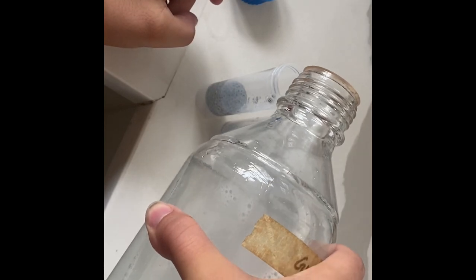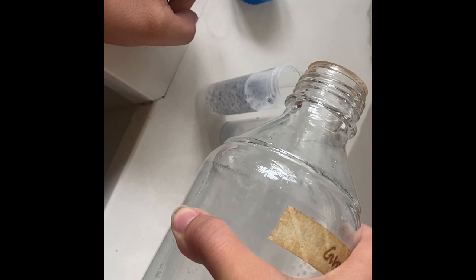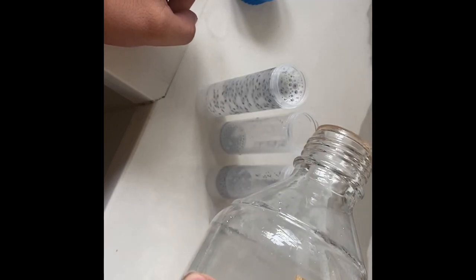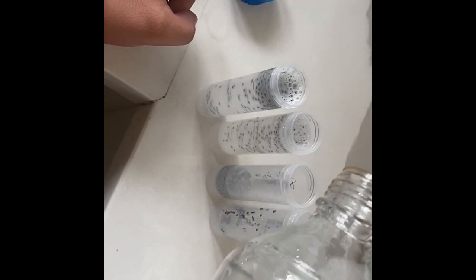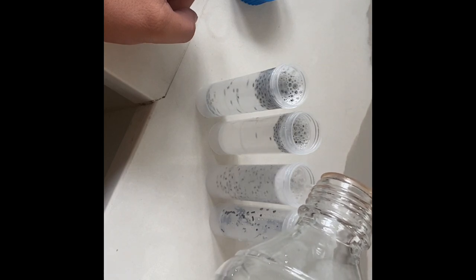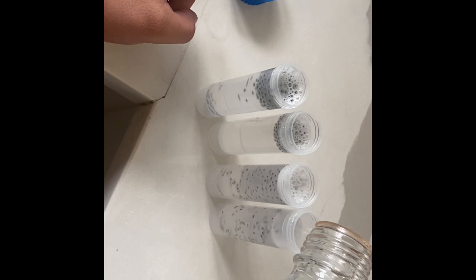You can see for the basil seeds, sometimes there's a little extra. That's okay. And again, these are gonna be in here for about 20 minutes. The last one will probably be about 25 minutes because it just takes time to clean. Here we go. That's 10% bleach with about half a drop of dish soap.